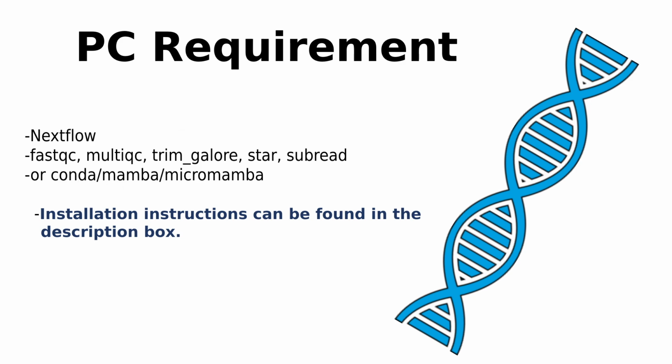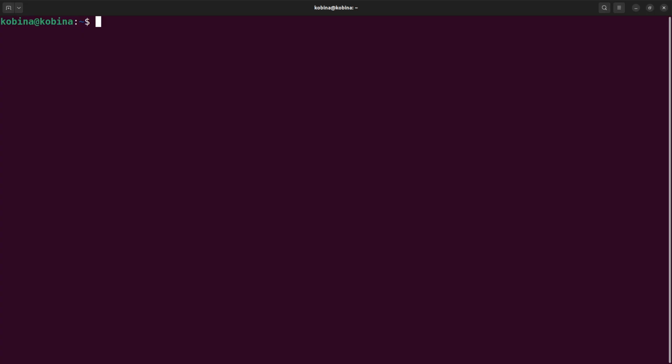I have tutorials that show how to install Conda and Mamba, so check the description box and you'll find the links to those videos. Use those and I will show you how to quickly install the rest of the tools. So let's go to the terminal first and then let's install the tools.